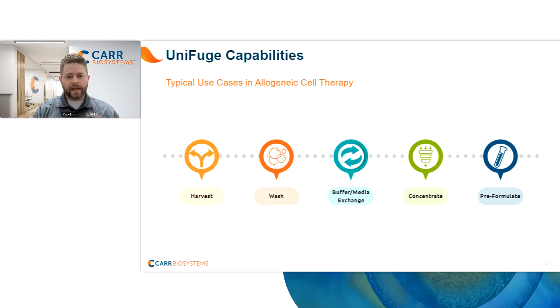So let's review those poll questions. Where are you today? How do you achieve optimal densities and desired solutions? It's interesting to see, and maybe not surprising, that a lot of us are in manual, quasi-closed systems, maybe using biosafety cabinets. We'll talk a little more later in the slides about why that might be, and why there might be some interesting choices to make in terms of ensuring future success.